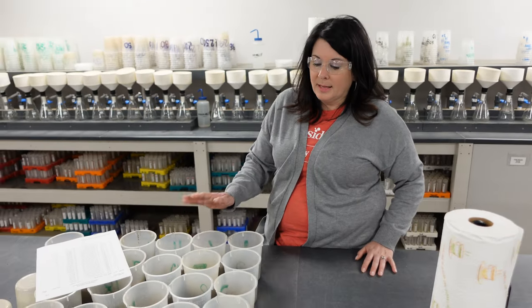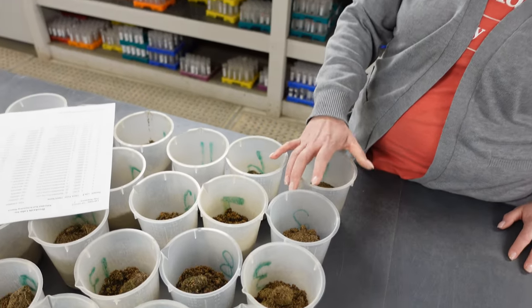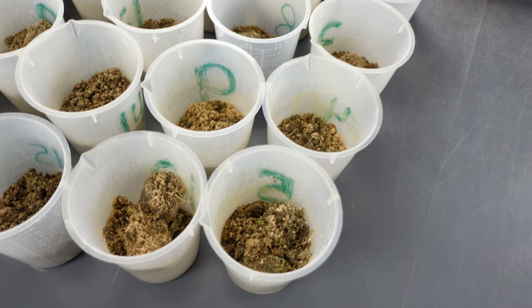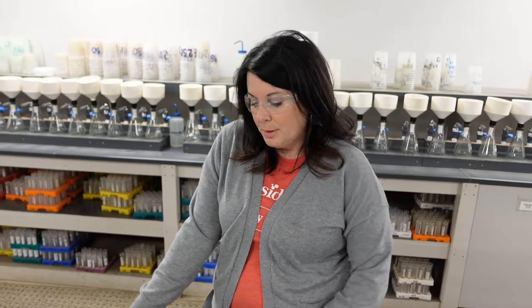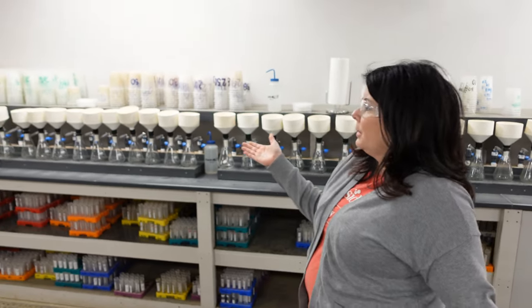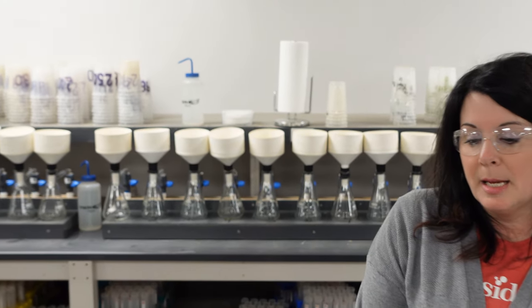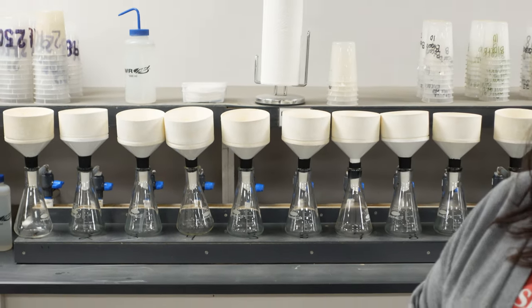Another test offered here at Brookside Labs is saturated soil. We take 200 to 250 grams of soil and place it in a cup. If irrigation water was provided by the client, we will saturate with irrigation water; otherwise we use DI water. We mix it to a pancake-like consistency. The sample will then rest overnight. In the morning, we place it in the top of the extracting vessel, which works on a vacuum — it will pull the liquid portion out of that pancake batter consistency into the beaker, and then the liquid portion is placed on our instrumentation for testing.